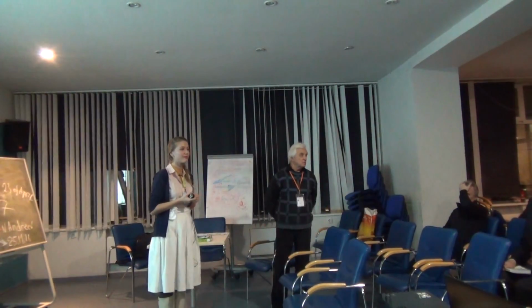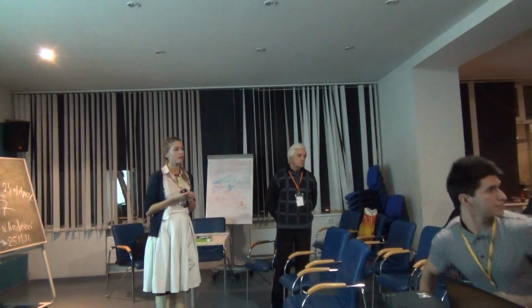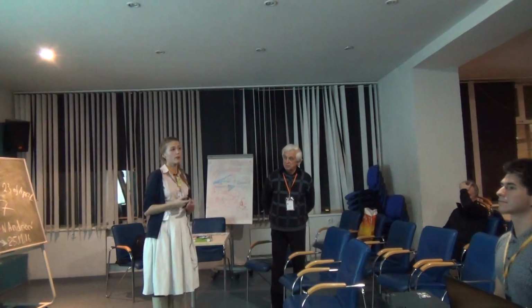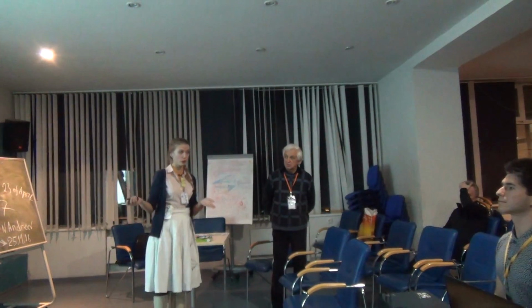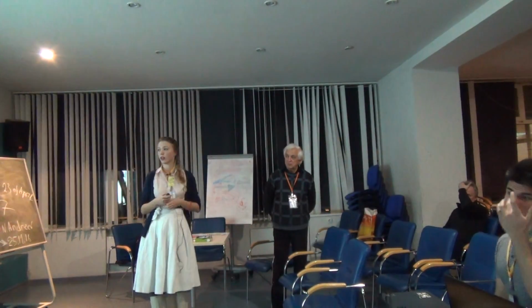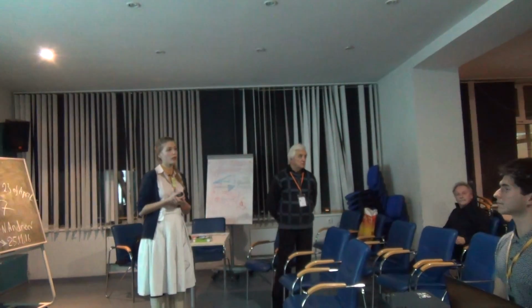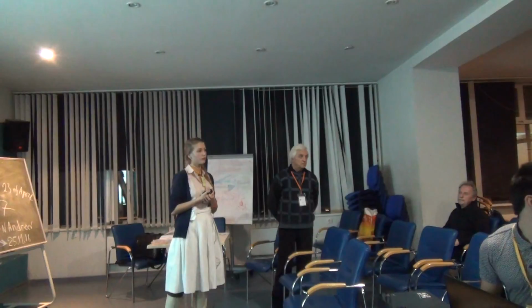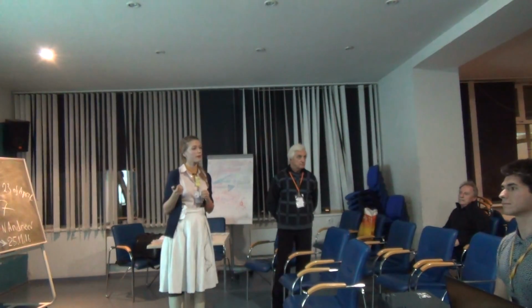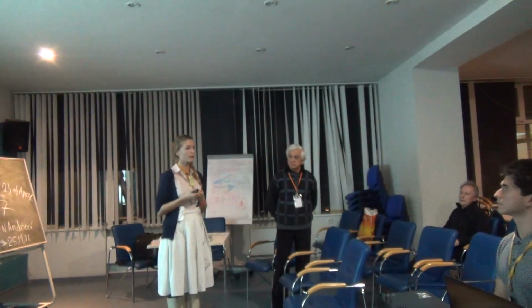Этот ЯМР-спектр можно пояснить, как вы его получали? Какой? Вот нижний. Нет, нижний я не получала, я его только обрабатывала. Я получала всю in vitro спектроскопию. Вы не знаете условия получения этого спектра? А что вас интересует? Я присутствовала просто при экспериментах. На каком приборе? Помещалось внутрь поля, да? Да, маленький трубик.